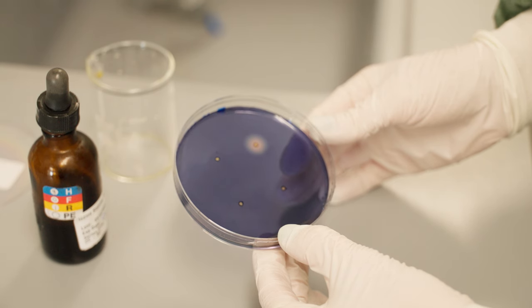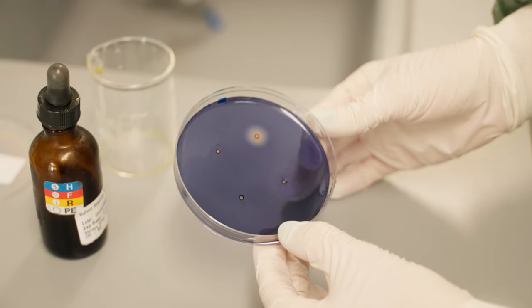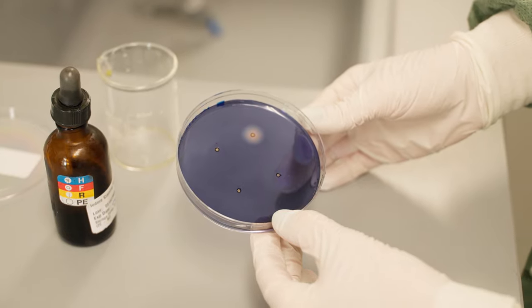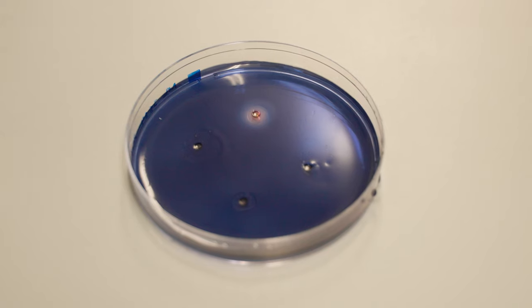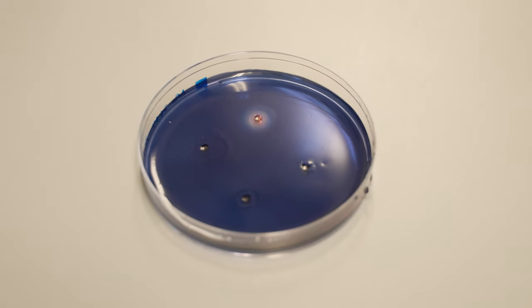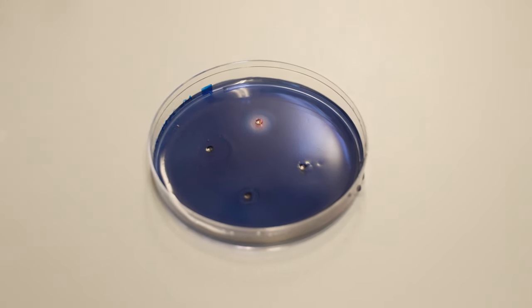A positive sample is when the ring size is equal or greater in size than the positive control. If the ring is less than the positive control but greater than the negative control, it is inconclusive. A negative result would be the absence of any clear ring.